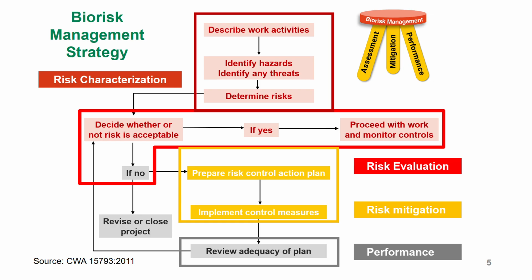So now, how do you revise or close the project? If you're doing testing, the simplest way to revise or close the project is you can decide as a laboratory to find another lab which has the resources to actually handle that particular agent. So you can refer that agent to them. Whenever you have samples of Ebola, you send them to that particular lab to do the testing, because they have the proper mitigations that are reducing or eliminating the risk of testing for Ebola.